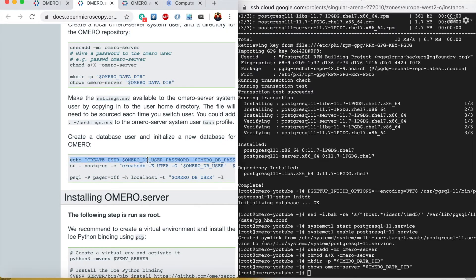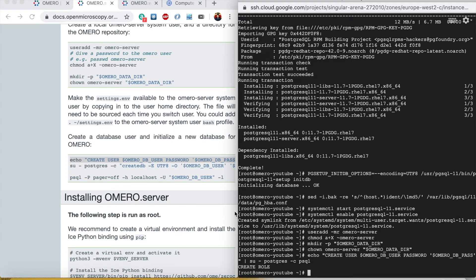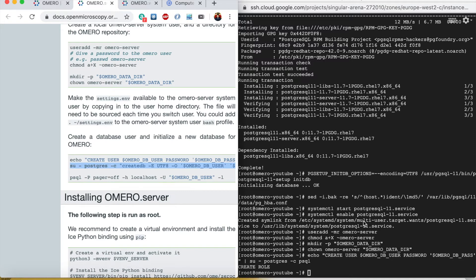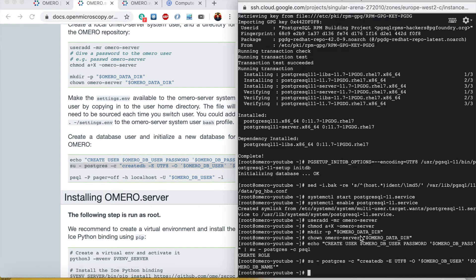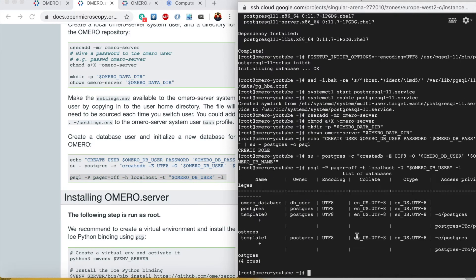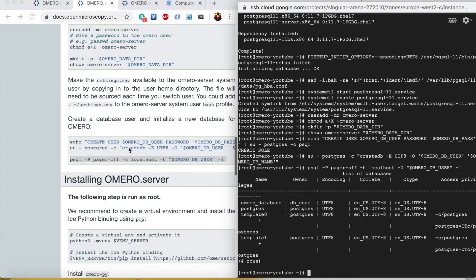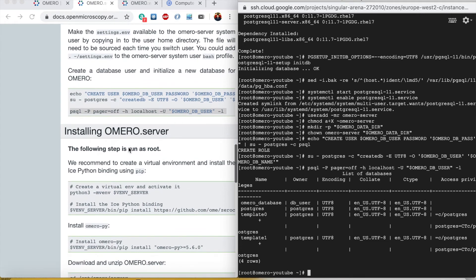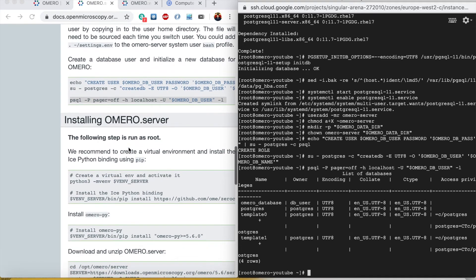Now we will create the user in the database. We created the role and we created the DB and we display the tables, etc. The database created properly.